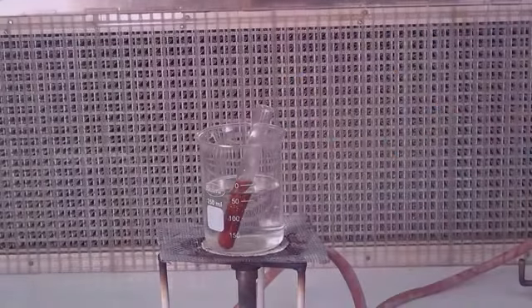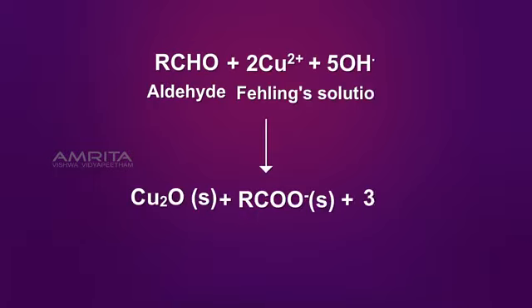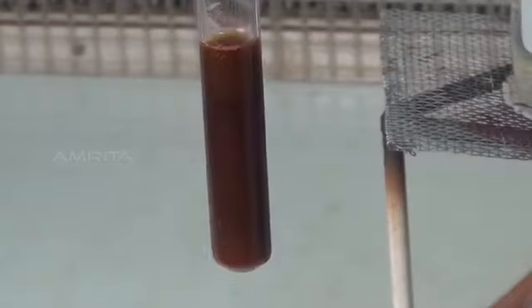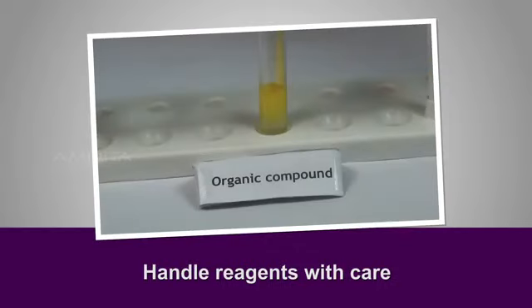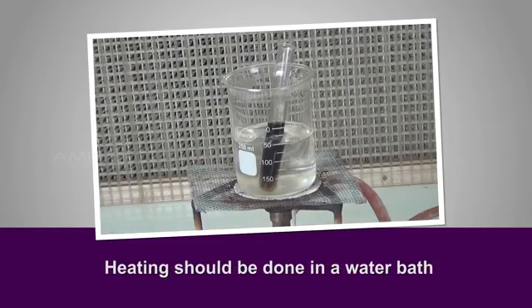Aldehyde reduces copper-2 ions present in the test reagent to a red precipitate of copper-1 oxide. Precautions: handle reagents with care. Heating should be done in a water bath.